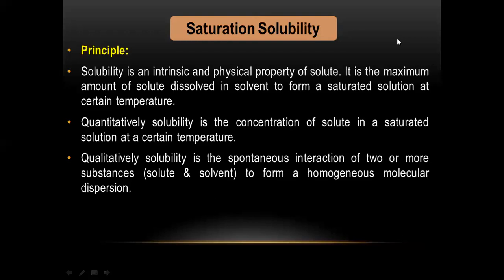Principle involved in the saturation solubility determination. Solubility is an intrinsic and physical property of the solute. It is the maximum amount of solute dissolved in a solvent to form a saturated solution at a certain temperature. That means at a different temperature, the solubility will vary. Quantitatively, solubility is the concentration of solute in the saturated solution at a certain temperature, and qualitatively, solubility is a spontaneous interaction of two or more substances, that is solute and solvent, to form a homogeneous molecular dispersion.